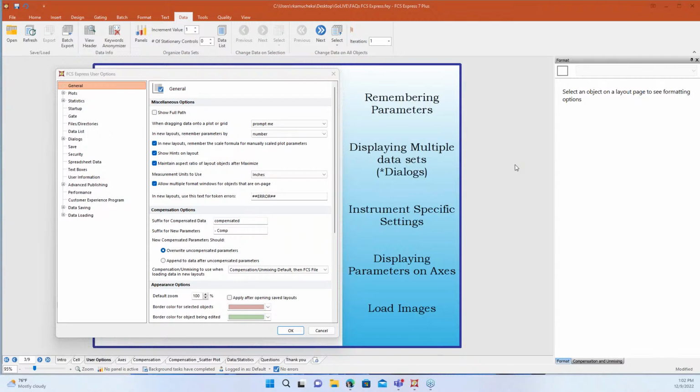And a lot of times it comes from if somebody's changed their tube or they've added a fluorochrome or an antibody to their tube or they've taken one away. So something that's going to make the number of parameters change, and then that's going to disrupt how the data loads into the layout. So when something like that happens, you can always kind of have this in the back of your mind, like, oh, maybe this has to do with how the layout is remembering my parameters, and maybe I need to do something with that. Yep, absolutely. So moving to our next thing, I often hear about displaying multiple data sets.